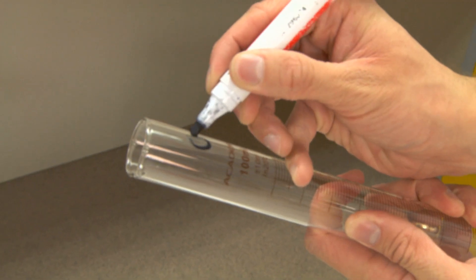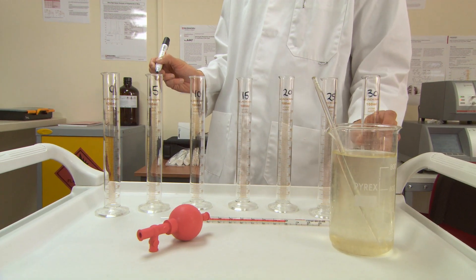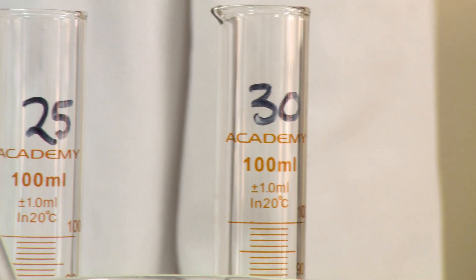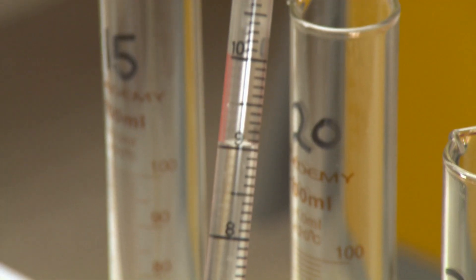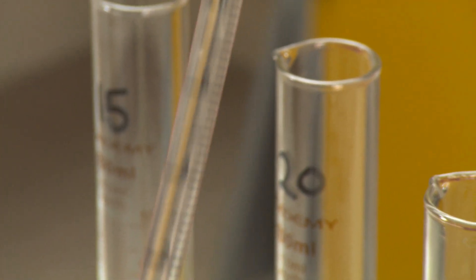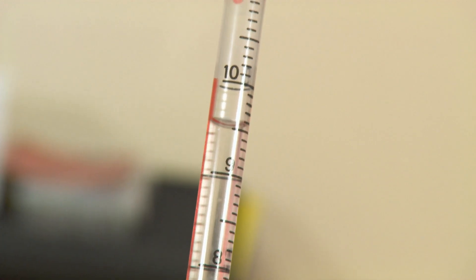Starting from zero, which is your control, label your cylinders in increments of 5 parts per million up to 30 parts per million. Using the 10 millilitre pipette, add the relevant finings amounts to your cylinders. Remember, 0.5 millilitres of kettle fining solution is 5 parts per million.